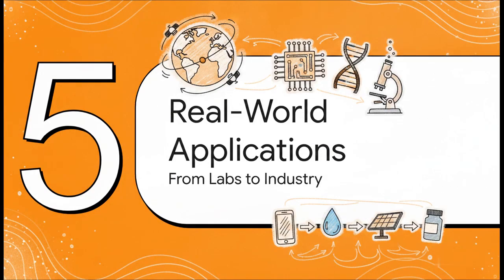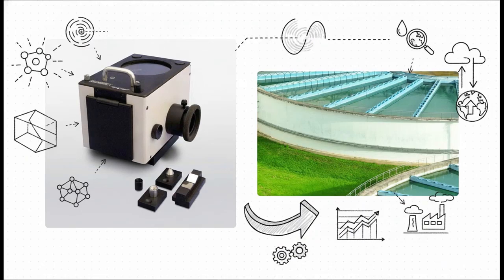And finally, Part 5, Real-World UV-Vis Applications. Let's see how all this physics and engineering actually impacts our daily lives. What makes UV-Vis so incredible is its sheer versatility. On one hand, you have academics analyzing cutting-edge metal oxides in a sterile lab, and on the other hand, it scales massively. We're talking huge industrial setups, monitoring environmental sustainability and public health. It's the exact same fundamental physics, just applied to entirely different challenges.